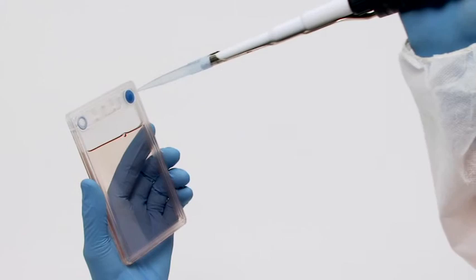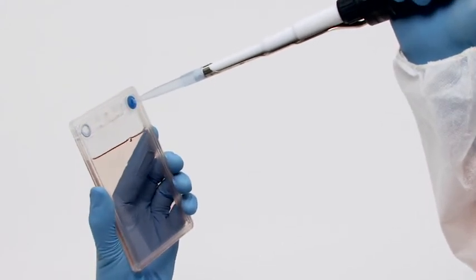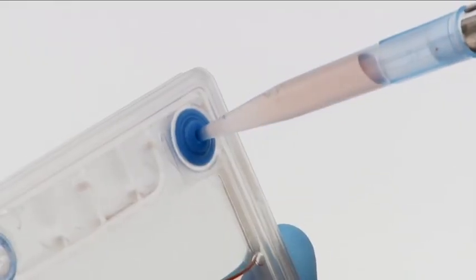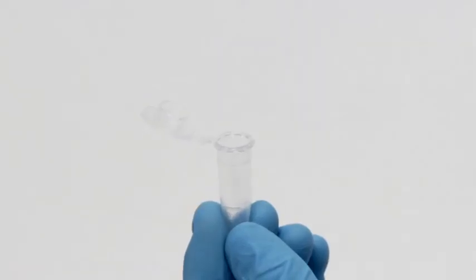To extract the pellet, use a micropipette with a 1 mL tip. Transfer the cells into a conical tube.